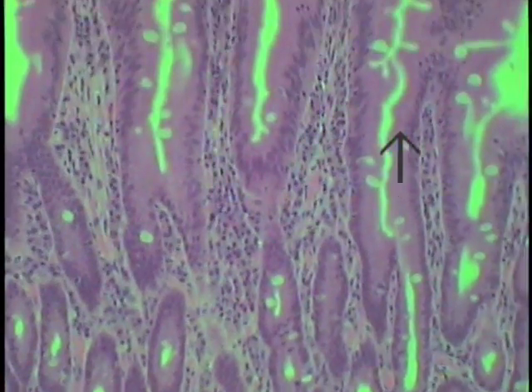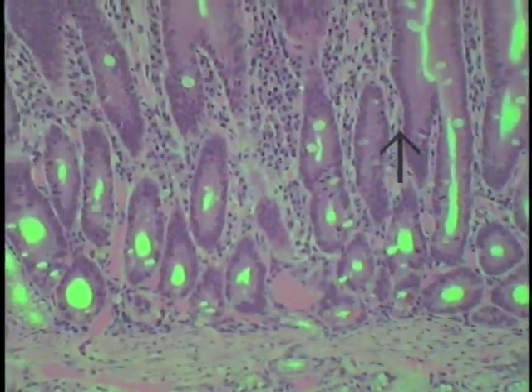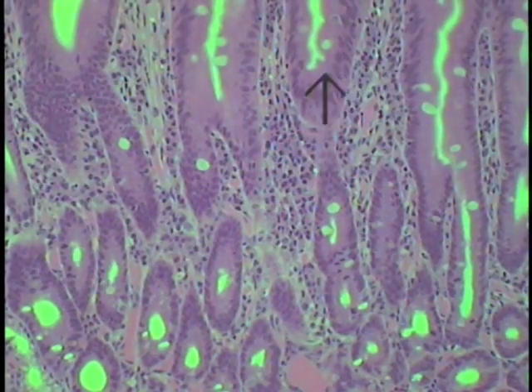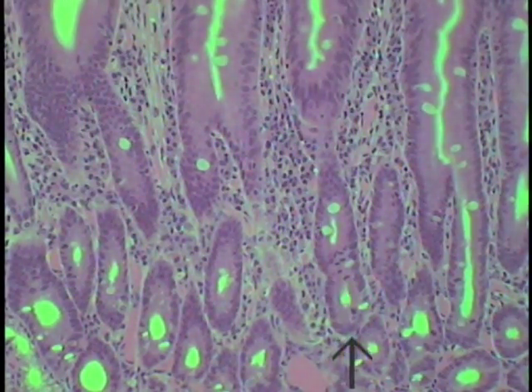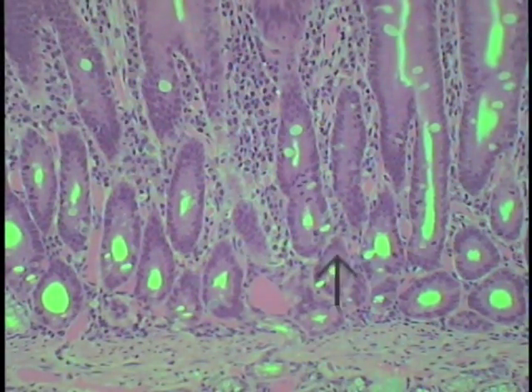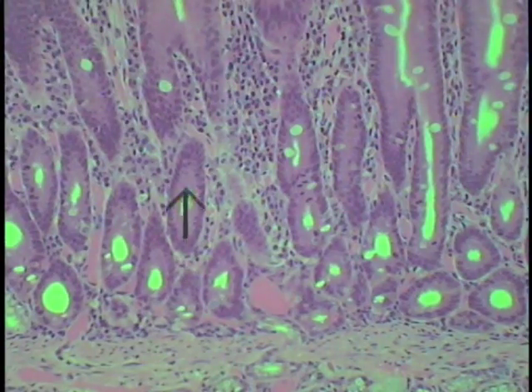base between two villi shown here. And as we trace it up, you can see that, though they're very close together. So this is an intestinal gland here as well. It has a little bit of a coiled core, so it's emptying into this space between these two villi and then coursing down in this direction, and probably angling such as this. So these are all profiles, though they're not all cut lengthwise because the tissue is so folded. These are all profiles of the intestinal glands, or the crypts of Lieberkuhn.